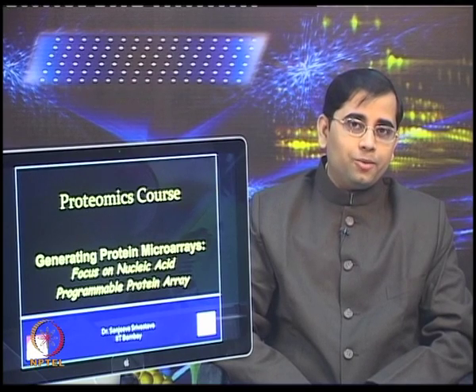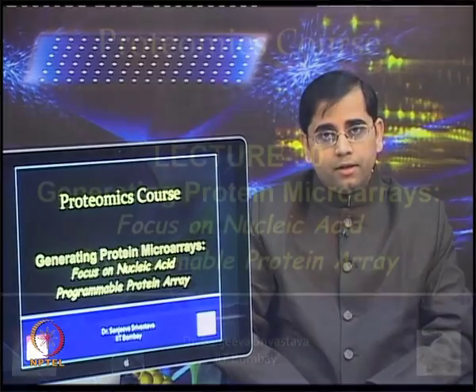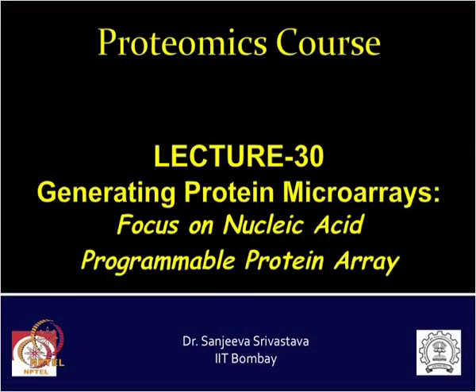Welcome to the Proteomics course. In today's lecture, we will talk about generating protein microarrays, and we will focus more on nucleic acid programmable protein arrays, also known as NAPPA.